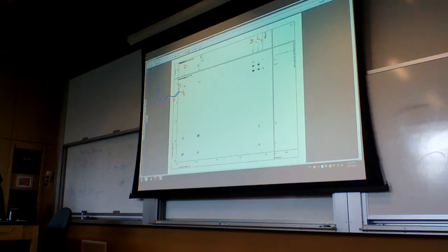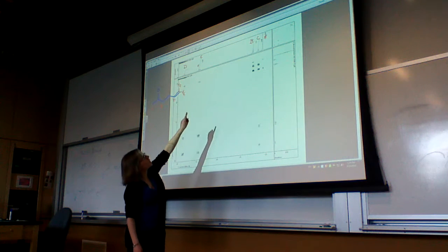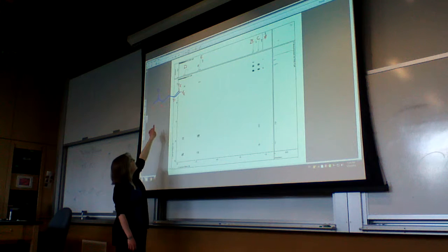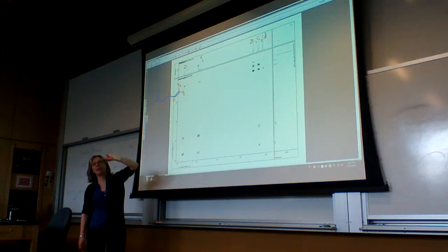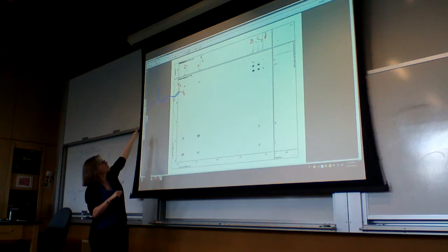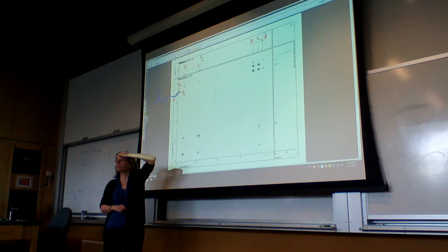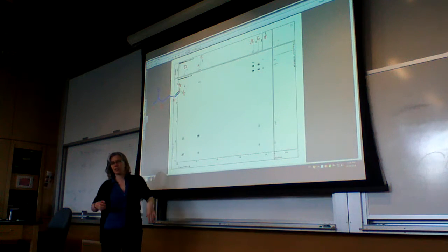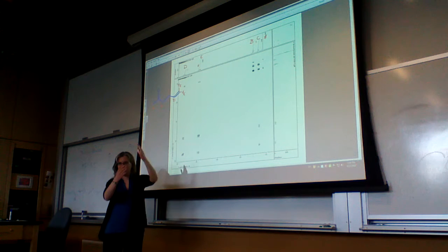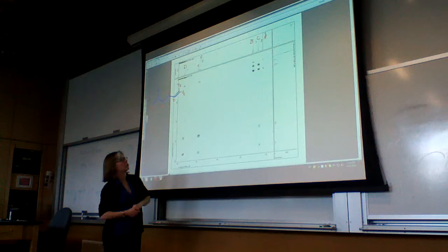So the first thing to look at is that the methyl group of the acetate does not have a cross peak except for B, and that might be a very slight coupling, but when you look at the methyl group, there's no actual splitting of the peaks, so that's a very weak interaction. But that is the closest peak to it. Methyl groups tend to give us a little bit stronger signals just because there's more hydrogens there, so they can show up a little bit more, and sometimes you see a big line of peaks all the way down, probably if you have a little bit too much noise in there.